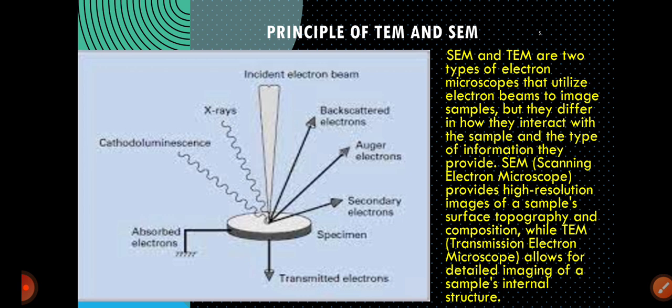As I told you in the second lecture video, if the emitted or reflected electrons are in phase, then they will form one reflected beam, an energetic electron beam.